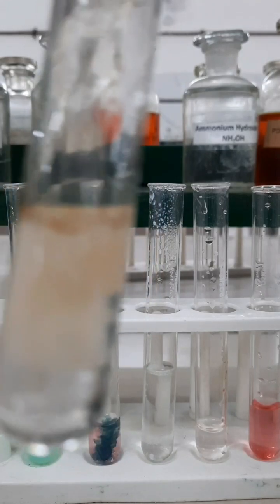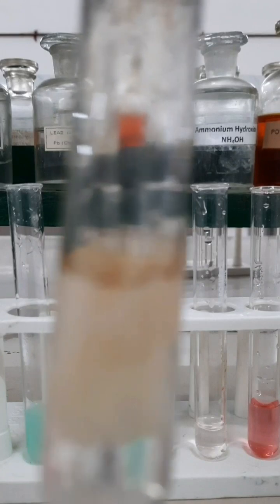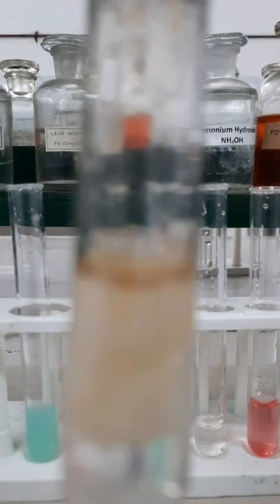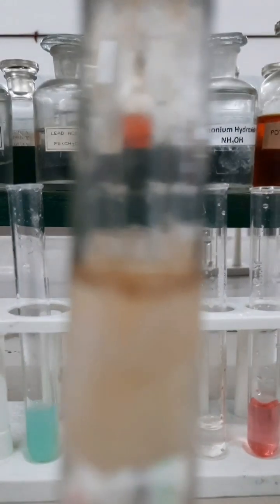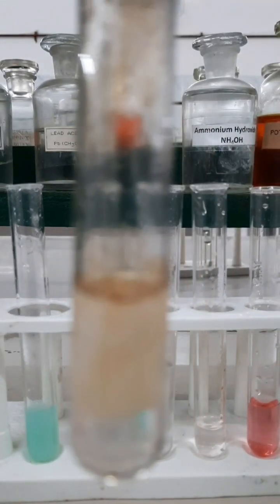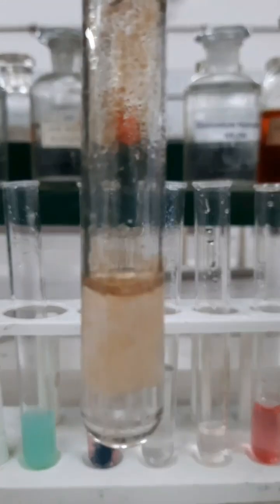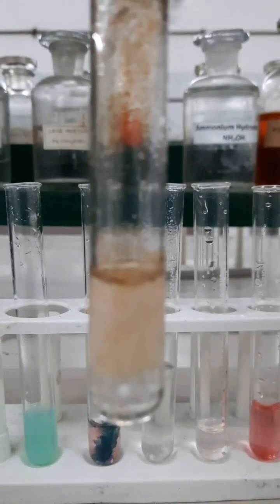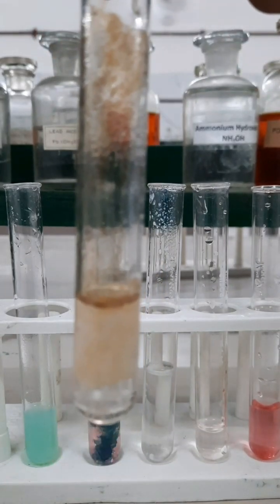On the upper layer, a brown colored precipitate of manganese oxide will be obtained due to the aerial oxidation of manganese hydroxide, and the upper layer turns brown.